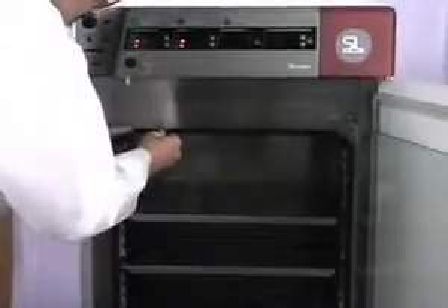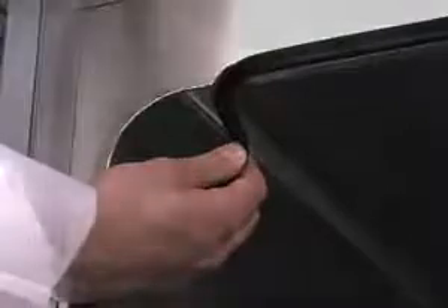The doors of these incubators are fitted with an autoclave-safe gasket, another important feature to help control contamination.